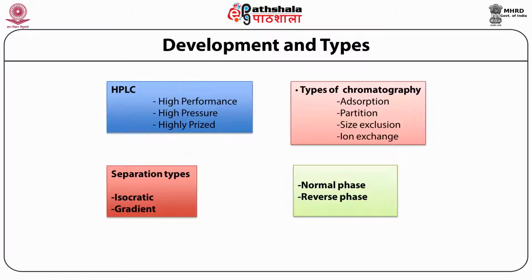It could be adsorption, or partition. Sometimes the principle is size exclusion or ion exchange. HPLC is an instrument used to separate and quantify the compounds from a mixture.